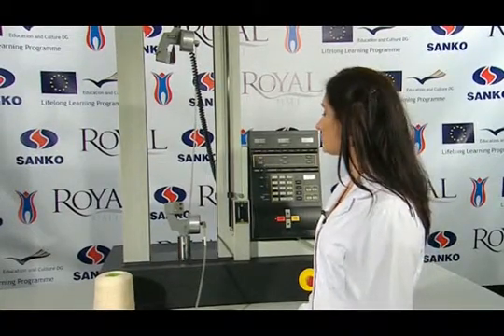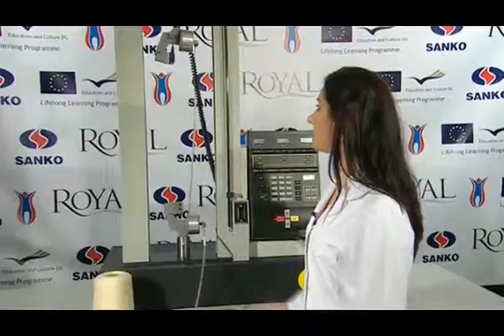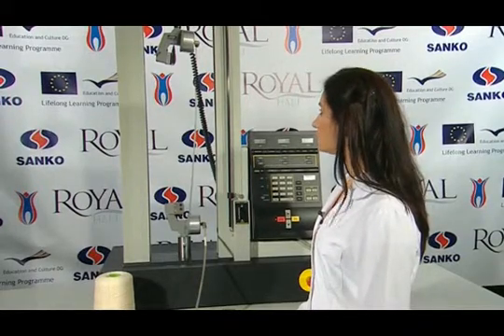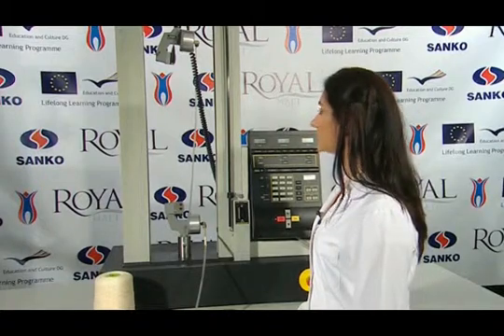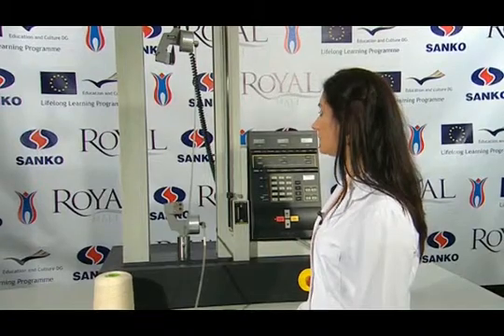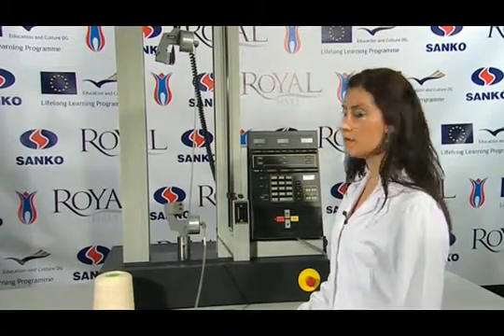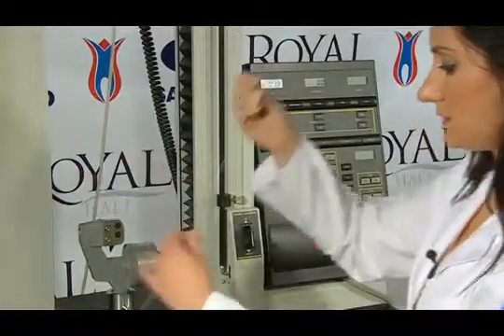Our device must be prepared for the test. The device has two nippers. One of them is the lower nipper, which is inactive. The upper nipper is the one which moves at a fixed speed. Firstly, the distance between the two nippers is set to 500 mm in accordance with the standard, and then the speed of the upper nipper is set to 500 mm per minute. Then the calibration settings are done according to the device operating instructions, and then our sample is placed into the nippers.